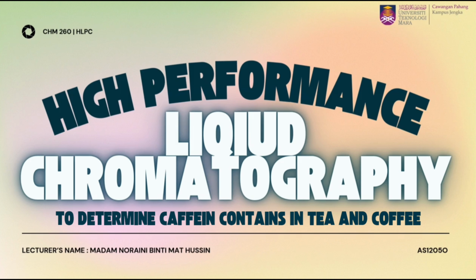We will be presenting high performance liquid chromatography to determine the caffeine contents in tea and coffee.